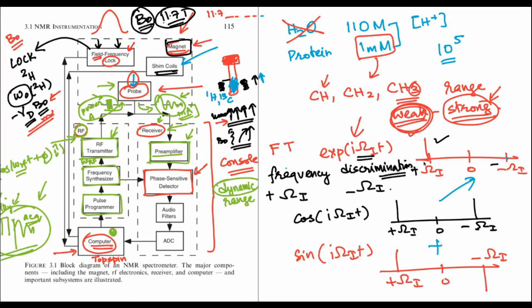This is a very important aspect where the omega RF that you had put in is actually subtracted. Remember, your signal is within a spectral width, and wherever your carrier was, you shifted it from the spectral width by plus omega RF. So you just subtract the omega RF, which is why this feedback is required depending upon how much you added. You subtract that to get the spectrum within the range that you have.